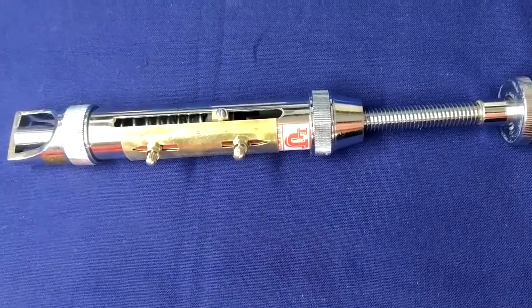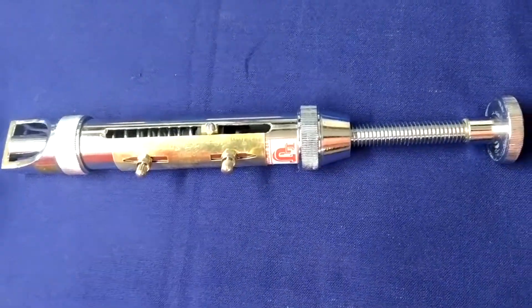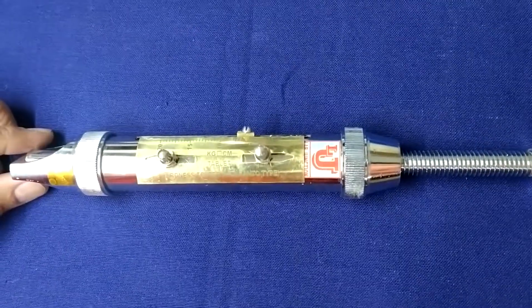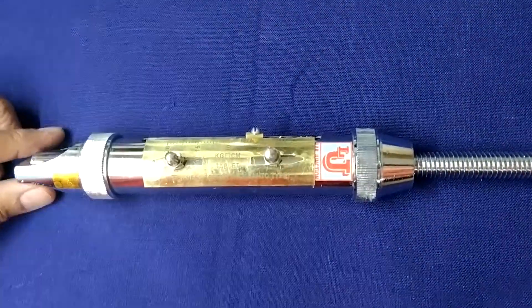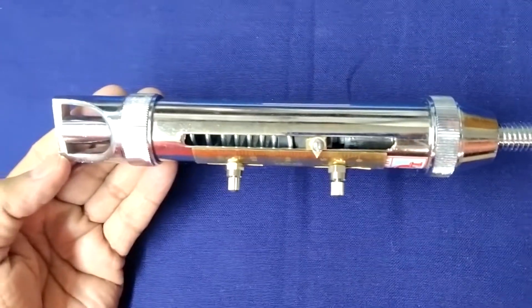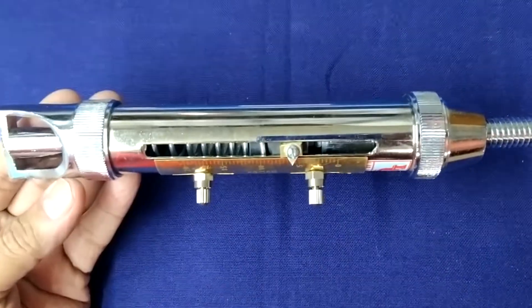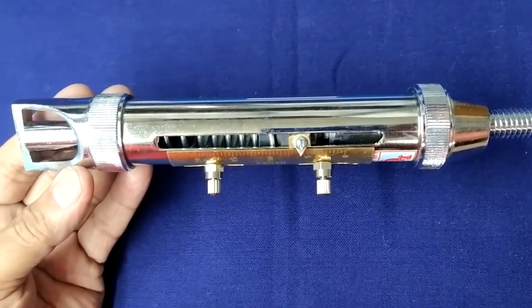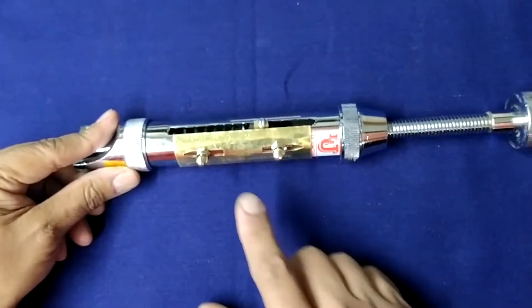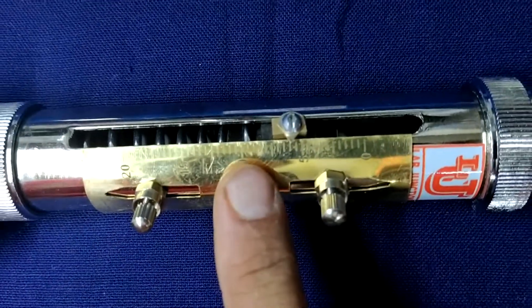Now, how can you use this hardness tester? Tablet hardness tester, Monsanto type. When we apply pressure to the tablet to crush it, the scale gives the reading in kg.